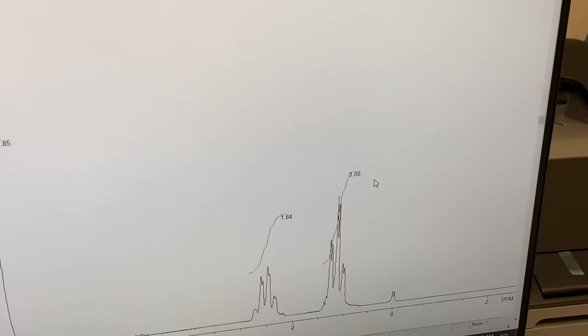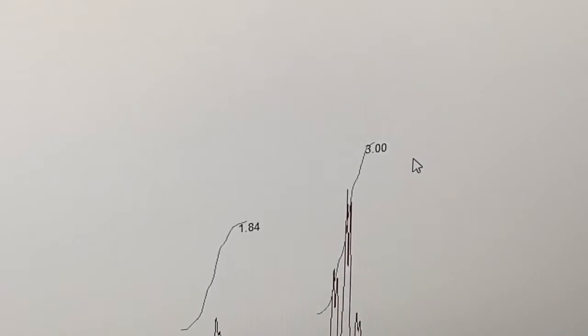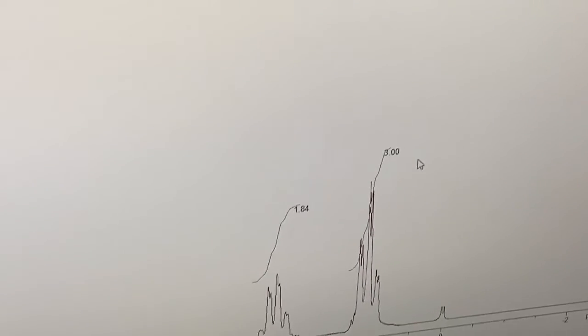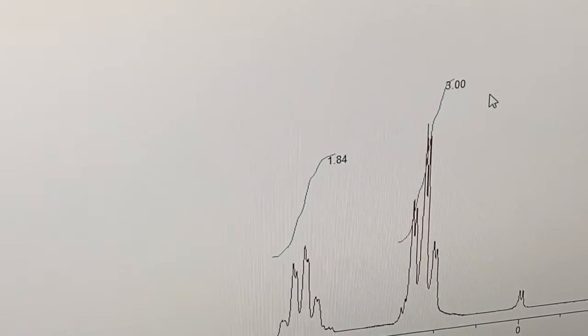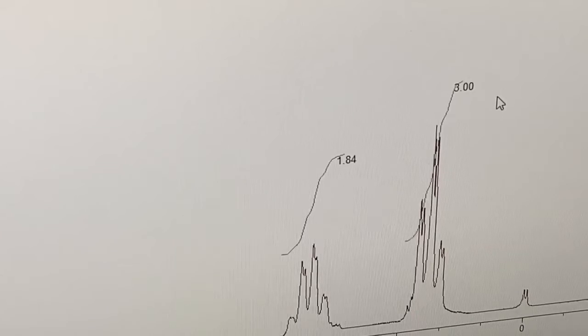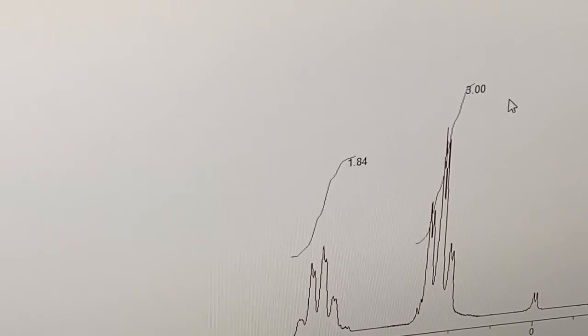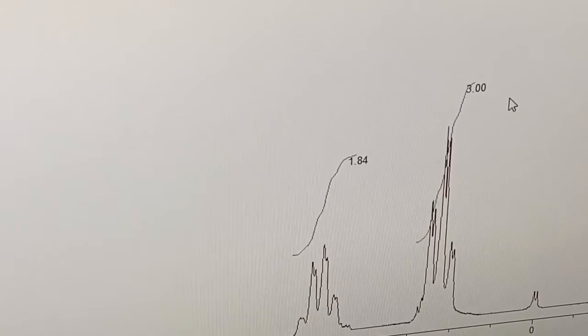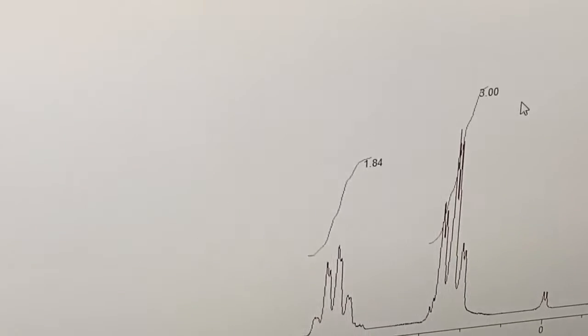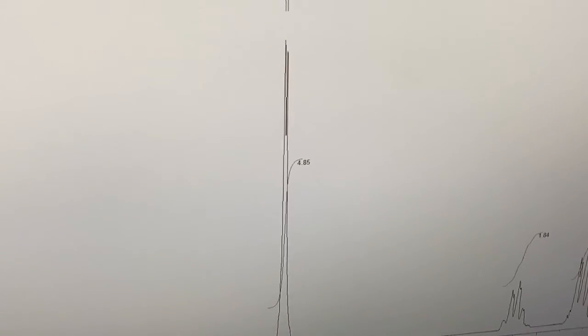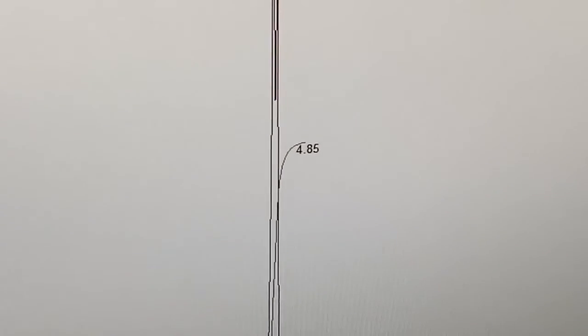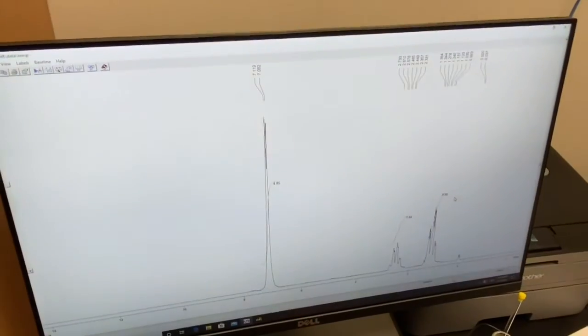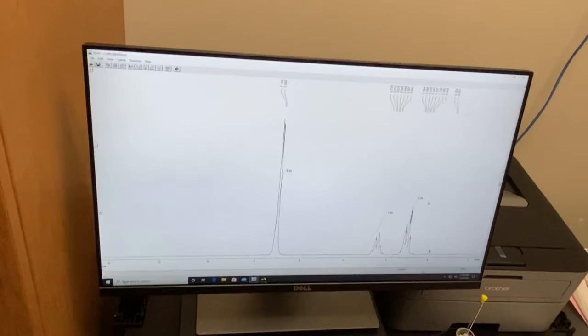You can see now, it labeled that triplet with a three, and it labeled the quartet a little more downfield as 1.84, which rounds to two, which it should be, that's an ethyl group. And then we have a monosubstituted benzene, which should integrate to five, 4.85, that's five. At this point in time, when you're happy with your integrals, you want to hit enter.